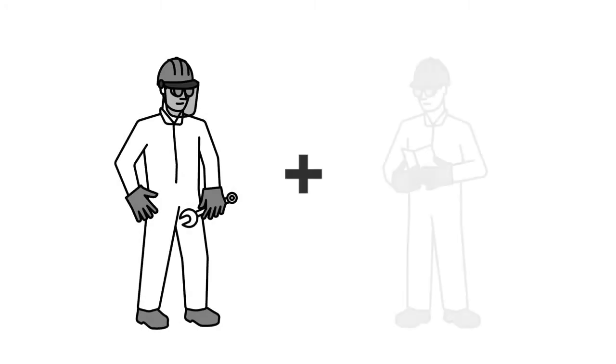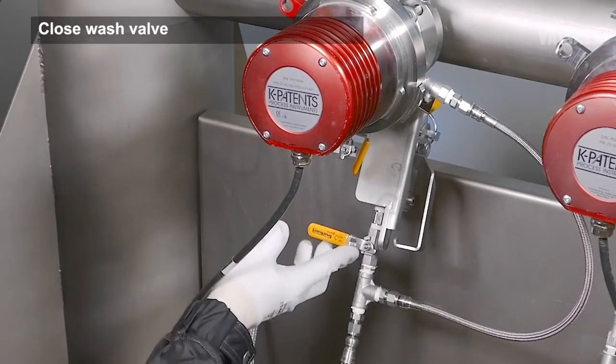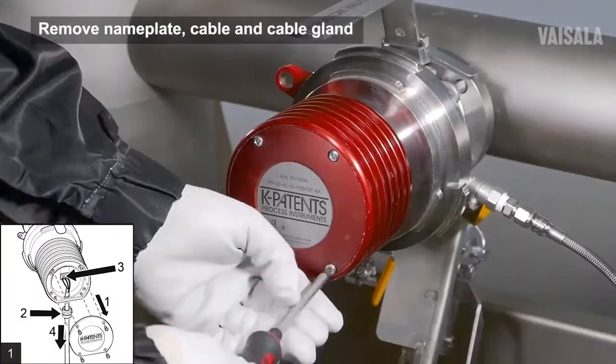Never operate the SafeDrive system alone. Close the wash valve. Switch off the DTR to cut off power from the sensor.